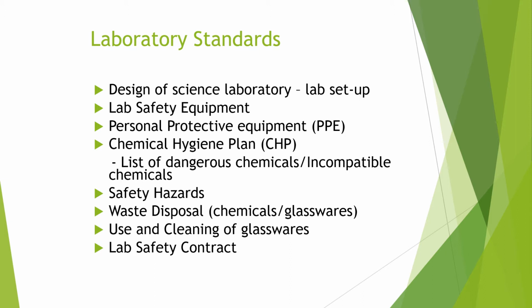For the laboratory standards, we are given standard designs on how you put up your science laboratory. This is what we call laboratory setup, where, for example, in one room, you will put all the materials for the biology lab. There is also one room for a chemistry lab or a physics lab. And each room should have installation of laboratory safety equipment.